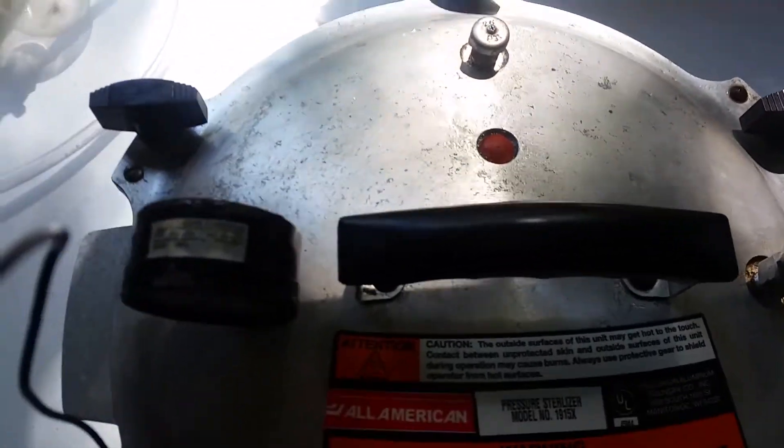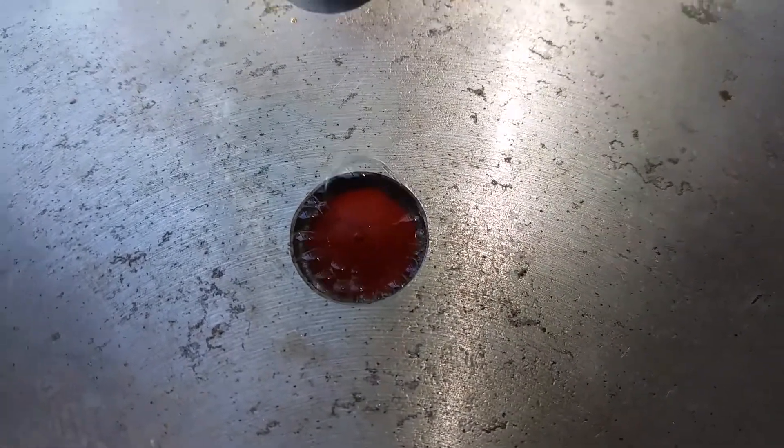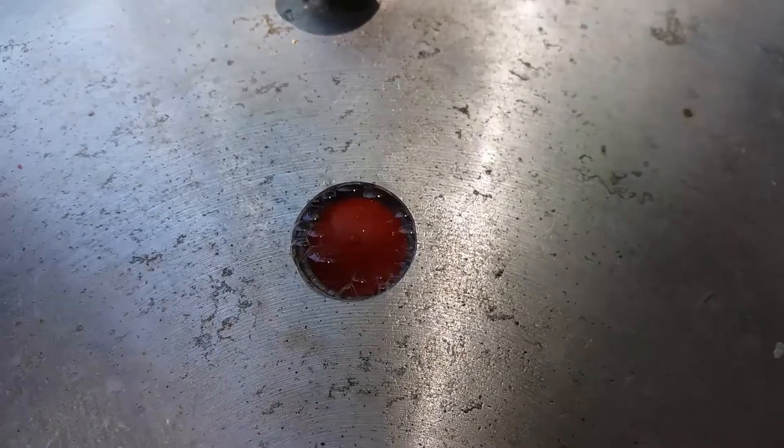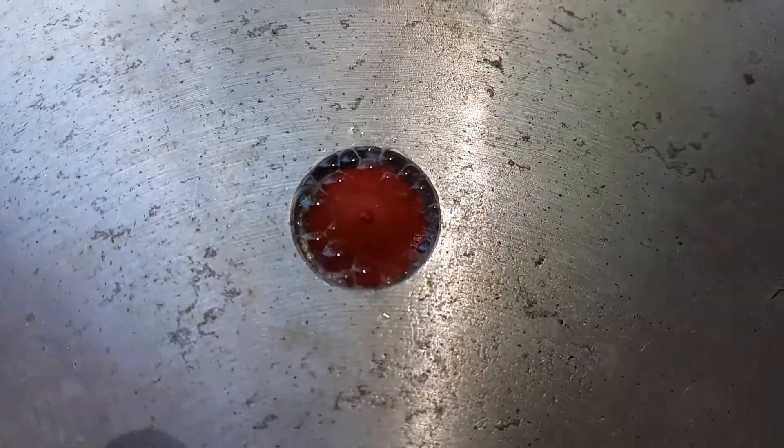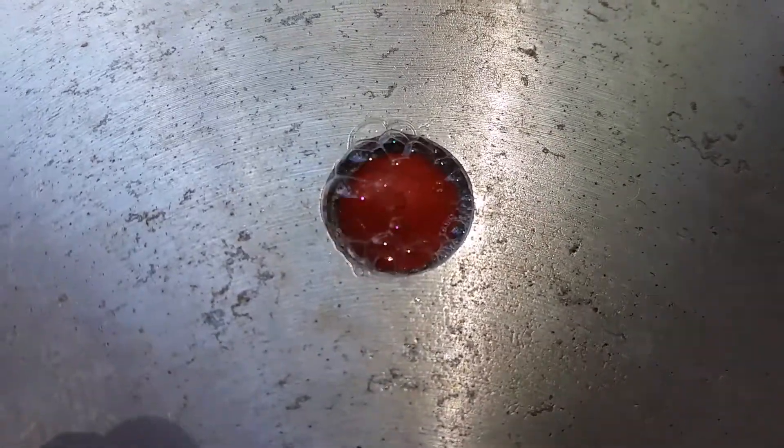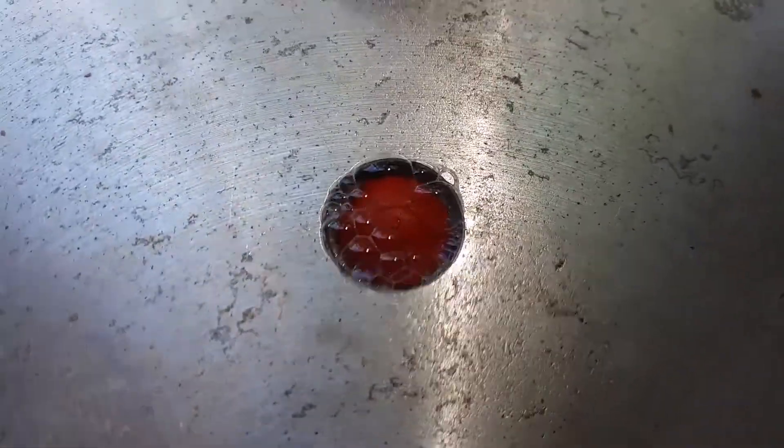So I went ahead and got everything dropped in and let it start pressurizing. And it appears that we have a leak at this safety valve. There was a little bit of water in there just because I washed this, rinsed it off before I stuck it on here. And so there's a bit of water in there. But that's what you see bubbling. So I do not think this is going to get up to pressure, not even a little.